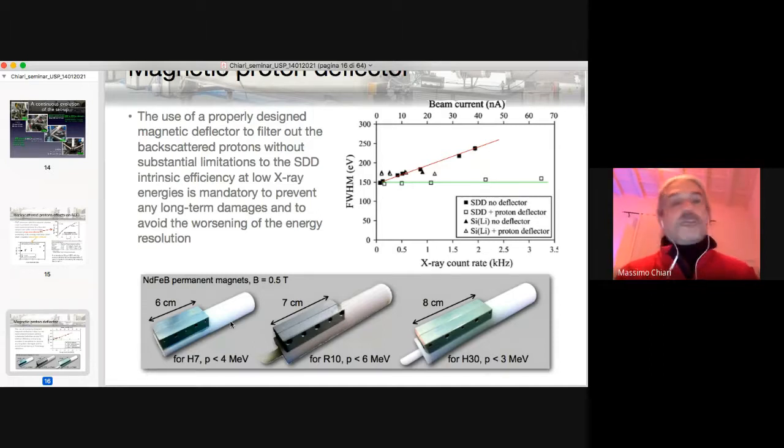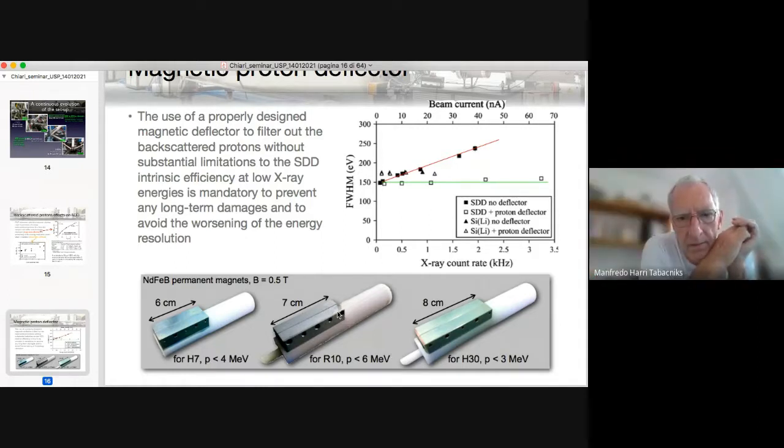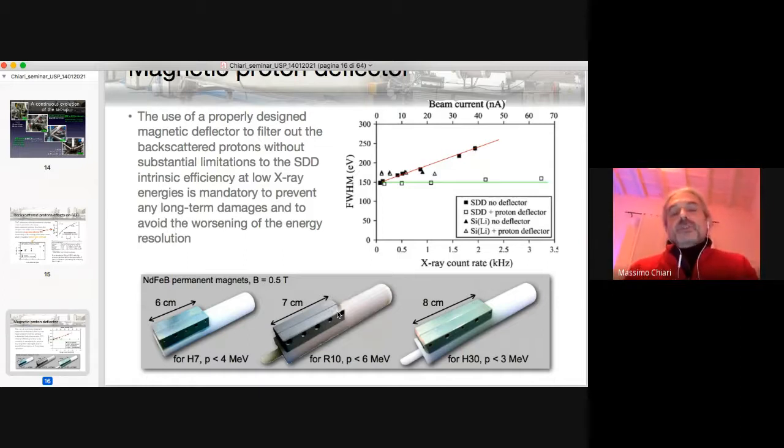There is a formula I've not shown you, but I have a PDF with all the passages and also the mechanical drawings for making these in our own machine workshop. And okay, that's all. Obviously, this means that the solid angle subtended is reducing accordingly.